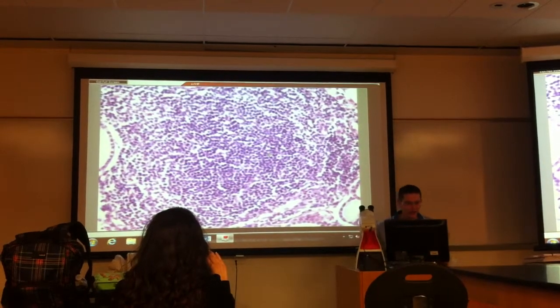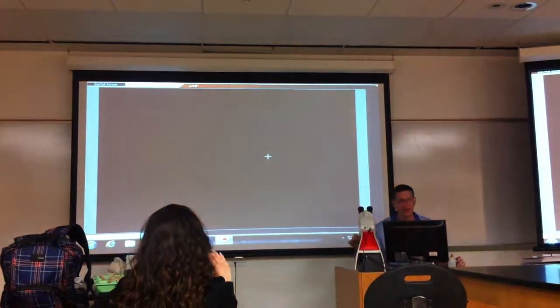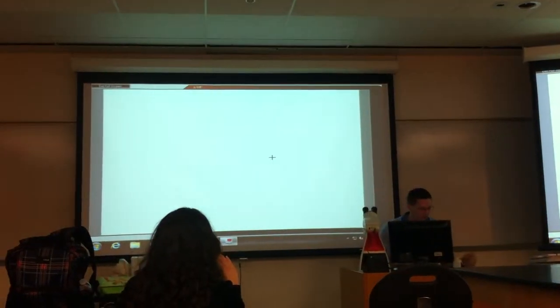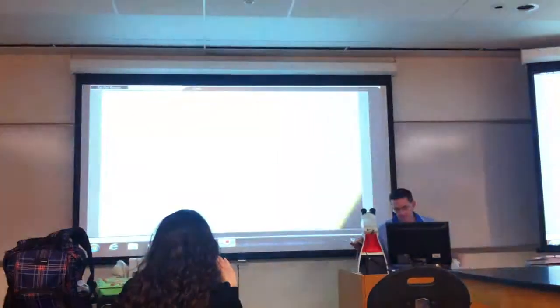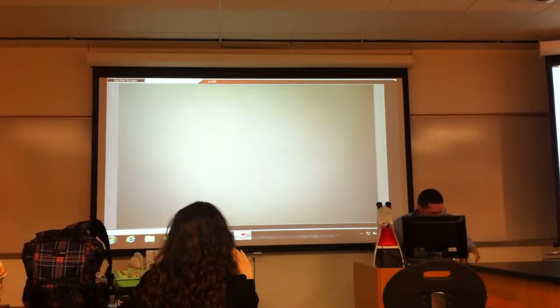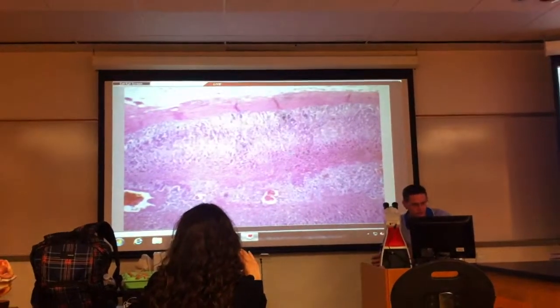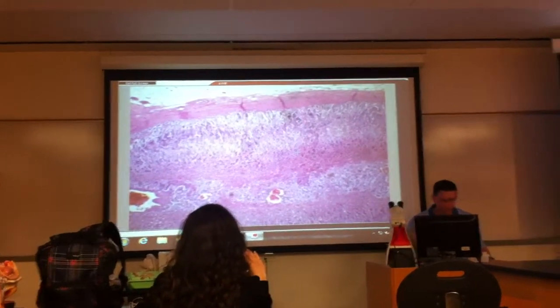But again, so parathyroid just on its own, it's really hard to distinguish, but because you'll always see it next door to thyroid, it's not that bad. Adrenal gland is identified mostly by the layers. So, look at that, it popped up pretty well.